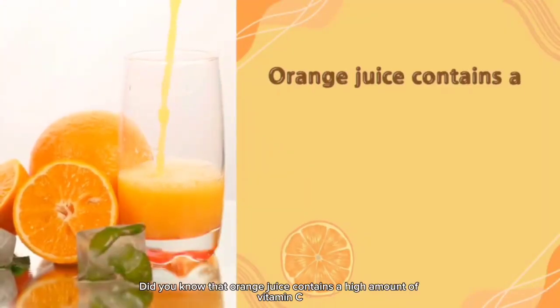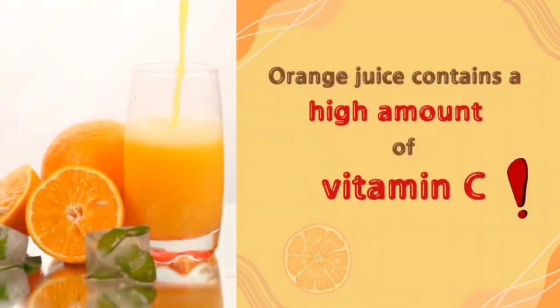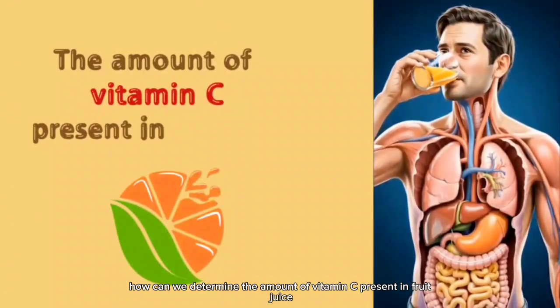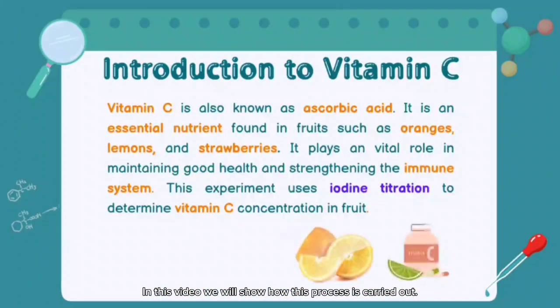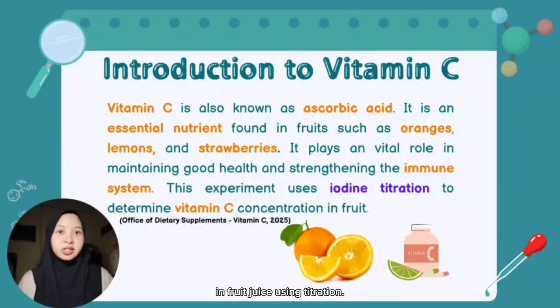Did you know that orange juice contains a high amount of vitamin C? But how can we determine the amount of vitamin C present in fruit juice? In this video, we will show how this process is carried out. Now, I will present our experiment on the determination of vitamin C in fruit juice using titration.